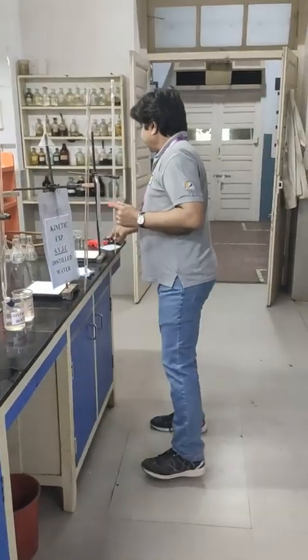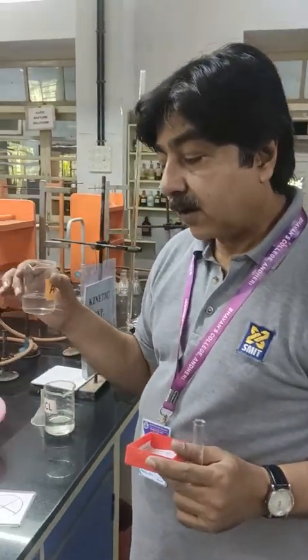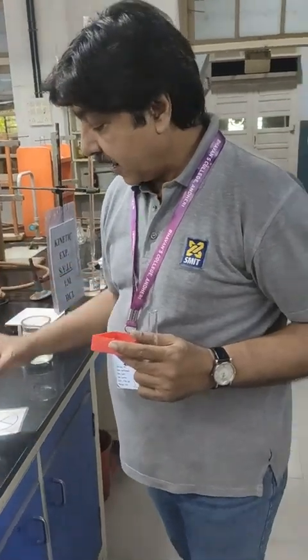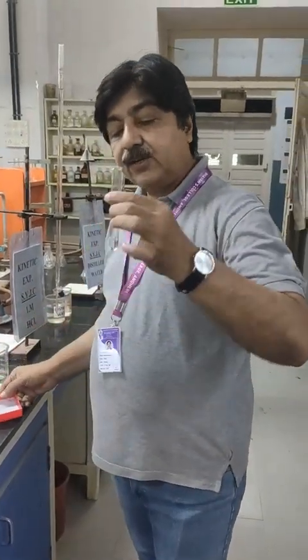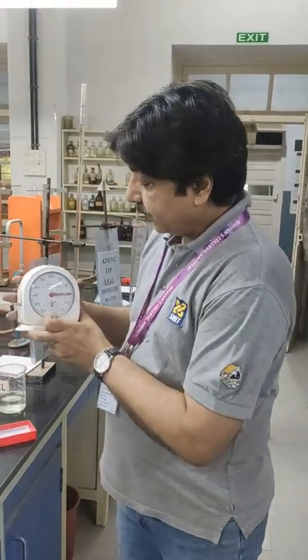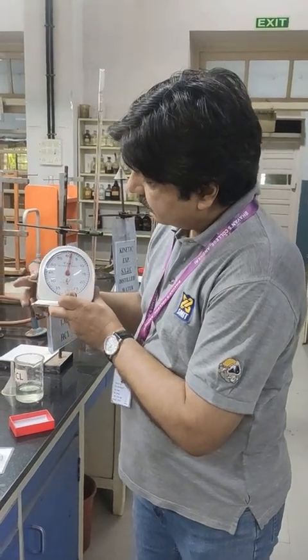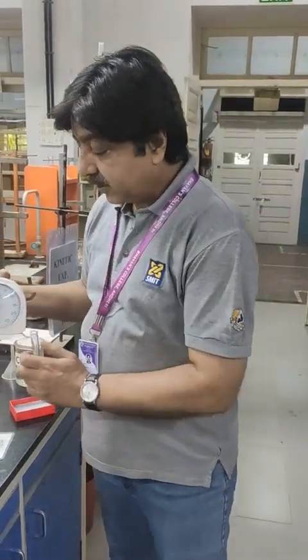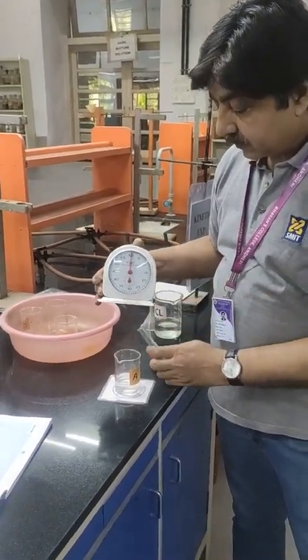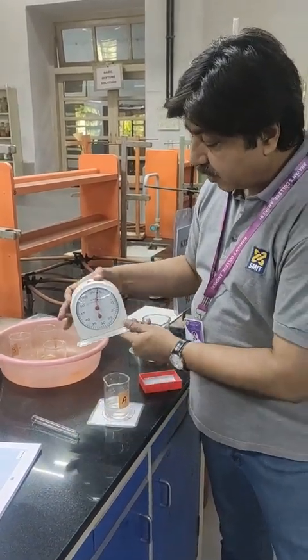So now I begin with the experiment. We have taken 20 ml of sodium thiosulfate. To that I have added 28 ml of water, and in this test tube I have taken 2 ml of HCl. Now the moment I add HCl, I have to start this stopwatch. I am adding, and I have started the stopwatch.